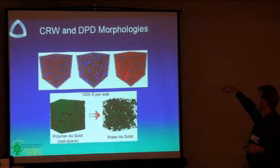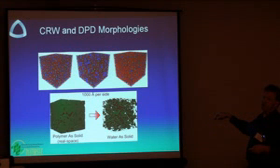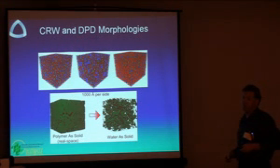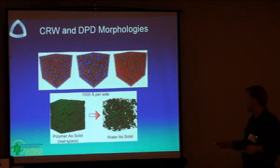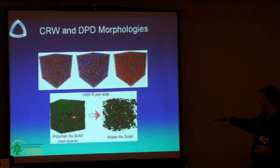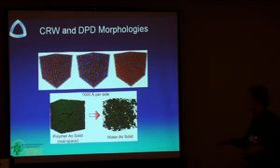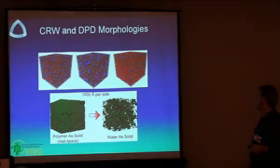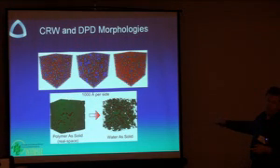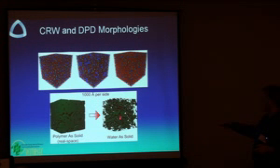And so this is a purely theoretical model, and this is from experimental data plus one other parameter, so it's a partial theoretical model, and the 2 models basically match, except the DPD has slightly smaller domains, but the morphology is the same. And so we believe this is a pretty powerful way of treating SAXS data to get an idea of what the structure of these films looks like. And if you extrapolate this out to the ideas of Greg Voth and Michael Hickner, you realize that what you want is to make these domains as small as possible. And so if you could actually use the SAXS to figure out what these are experimentally, then you can design your film to make smaller and smaller ones.